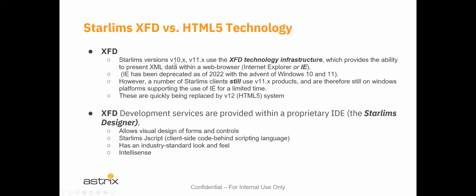So XFD was versions 10 and 11, and it really provided the ability to present XML data within a web browser, and in that case, it was only Internet Explorer. As of 2022, they're pretty much not pushing that at all. There are customers out there that still use it, that are basically in queue to be updated to a version 12 system, but we're going to encounter these out there still, and so we really do need to know about them still. And there are some components of those systems that we need to have in our toolboxes if we need to work with them.